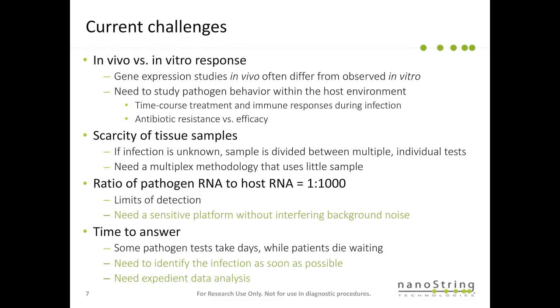To summarize, the challenges are, first, in vivo versus in vitro response. We know now that gene expression in vivo often differs significantly from observations in vitro. So you cannot just study the pathogen in a test tube and assume that you understand how the pathogen works during an infection.